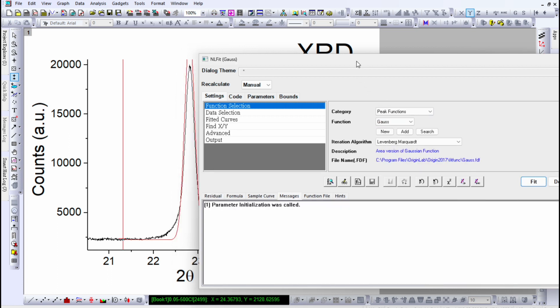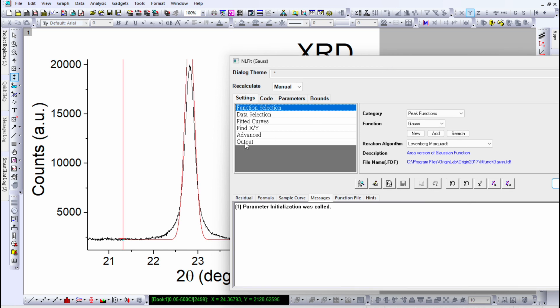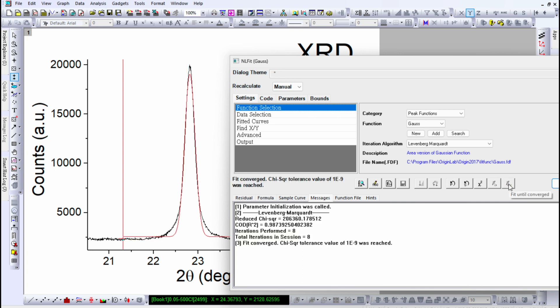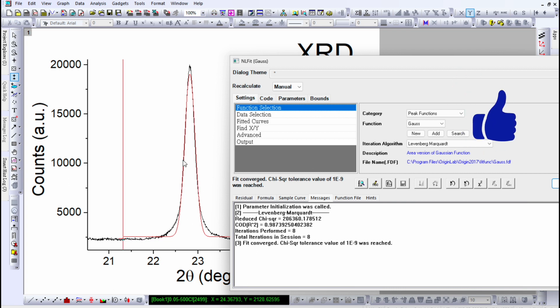Once you set the Gaussian peak function, it will automatically start to perform the fitting. You can find the option 'Fit Until Converge' — click on it and it will perform the best fitting using the Gaussian function on this XRD peak.